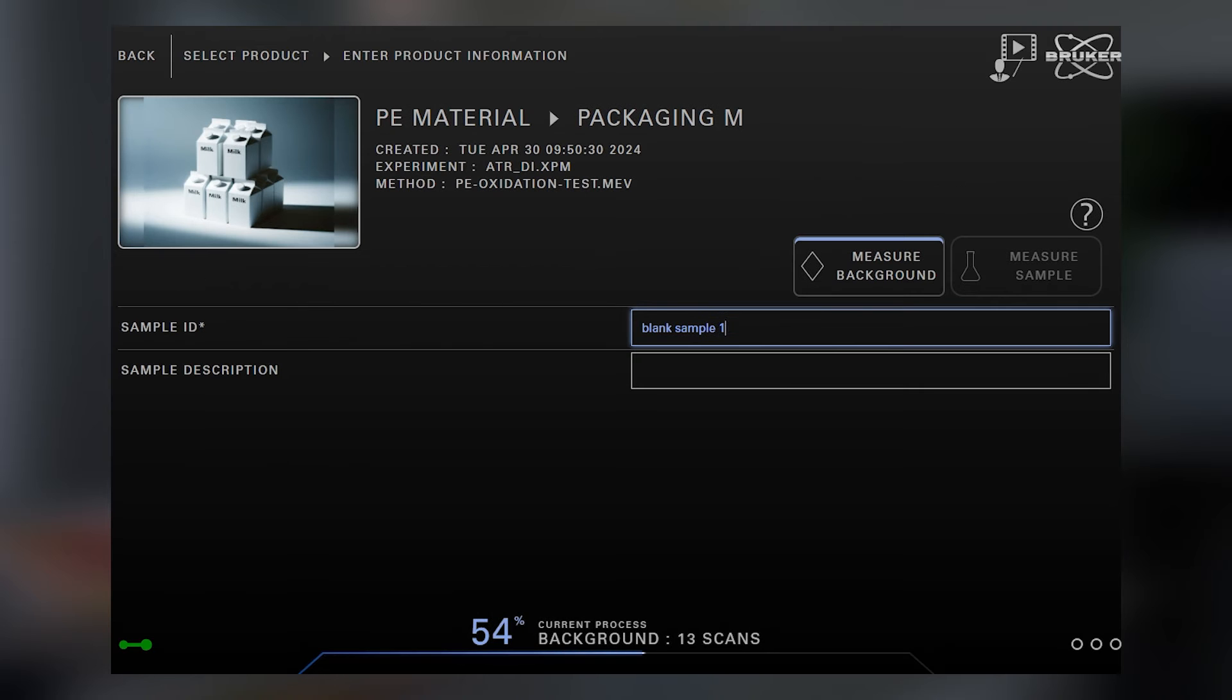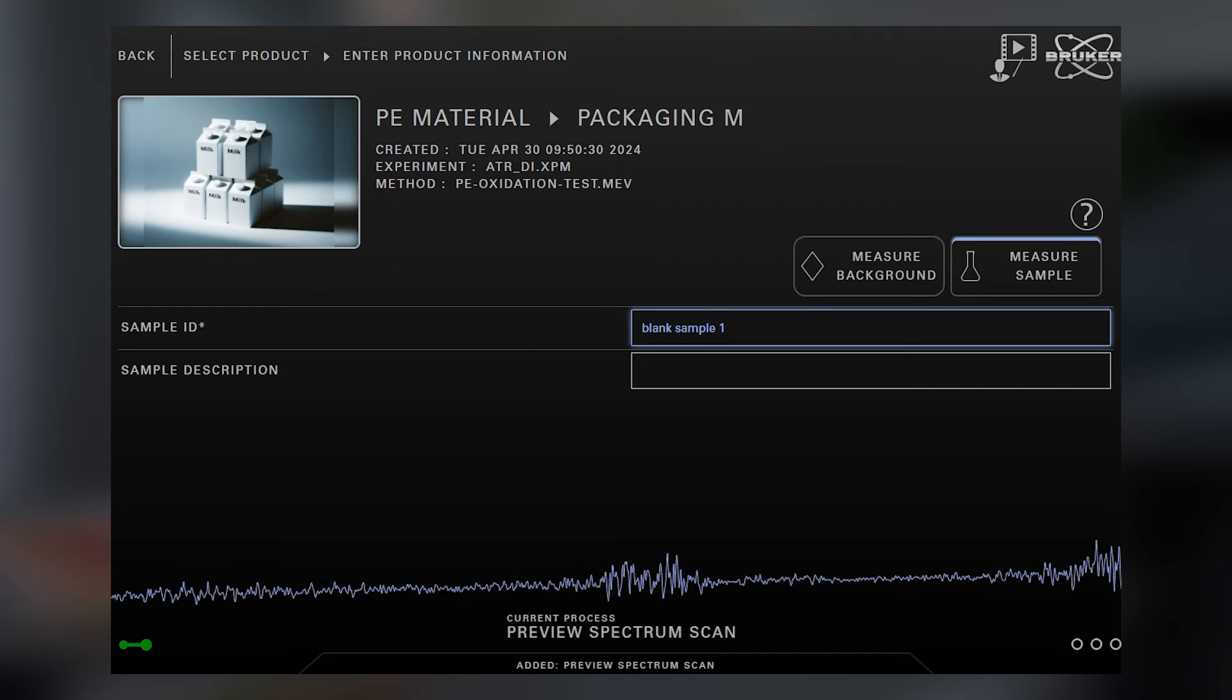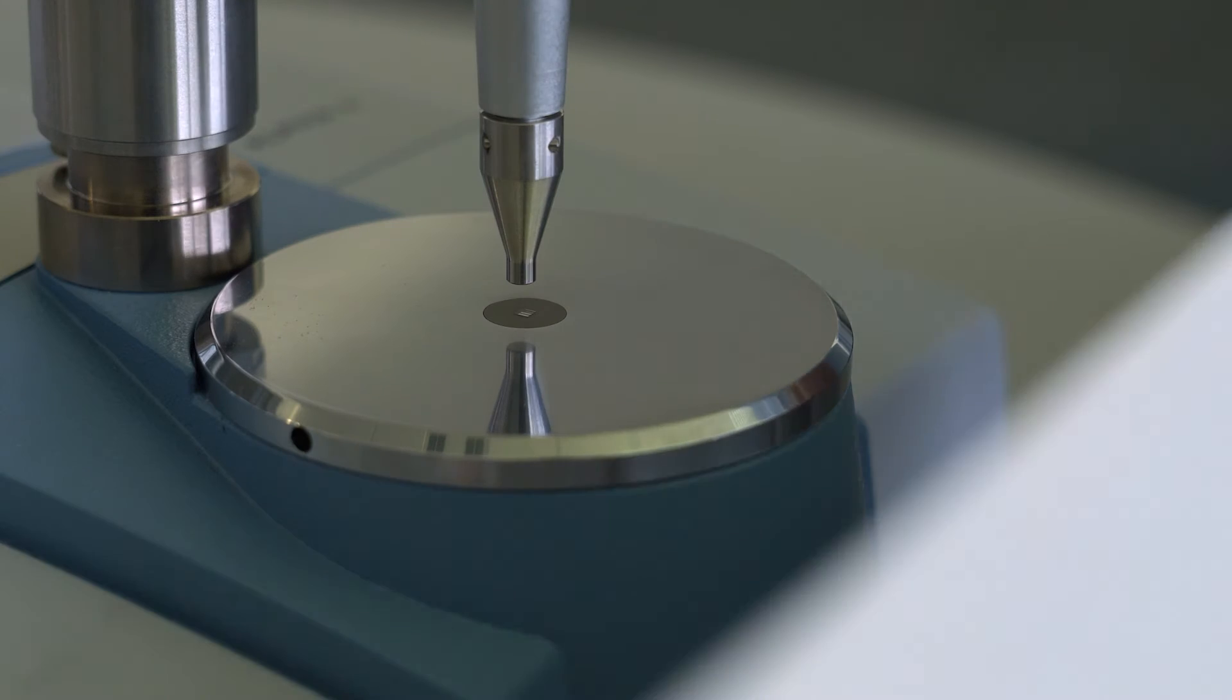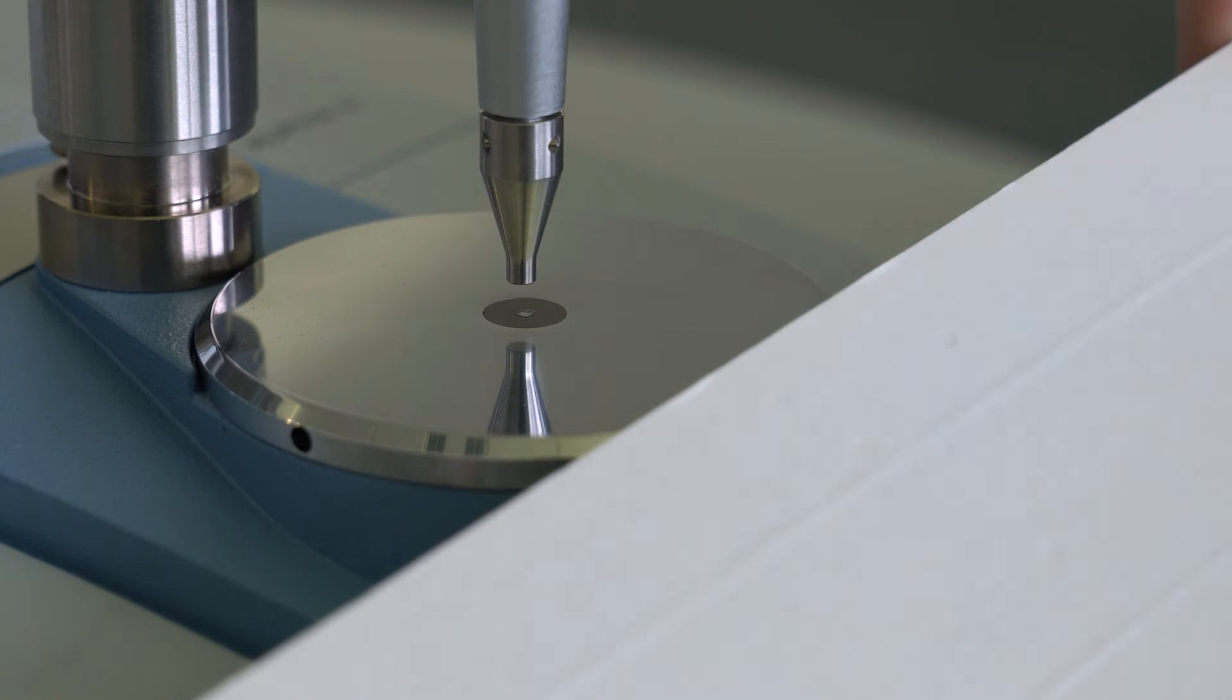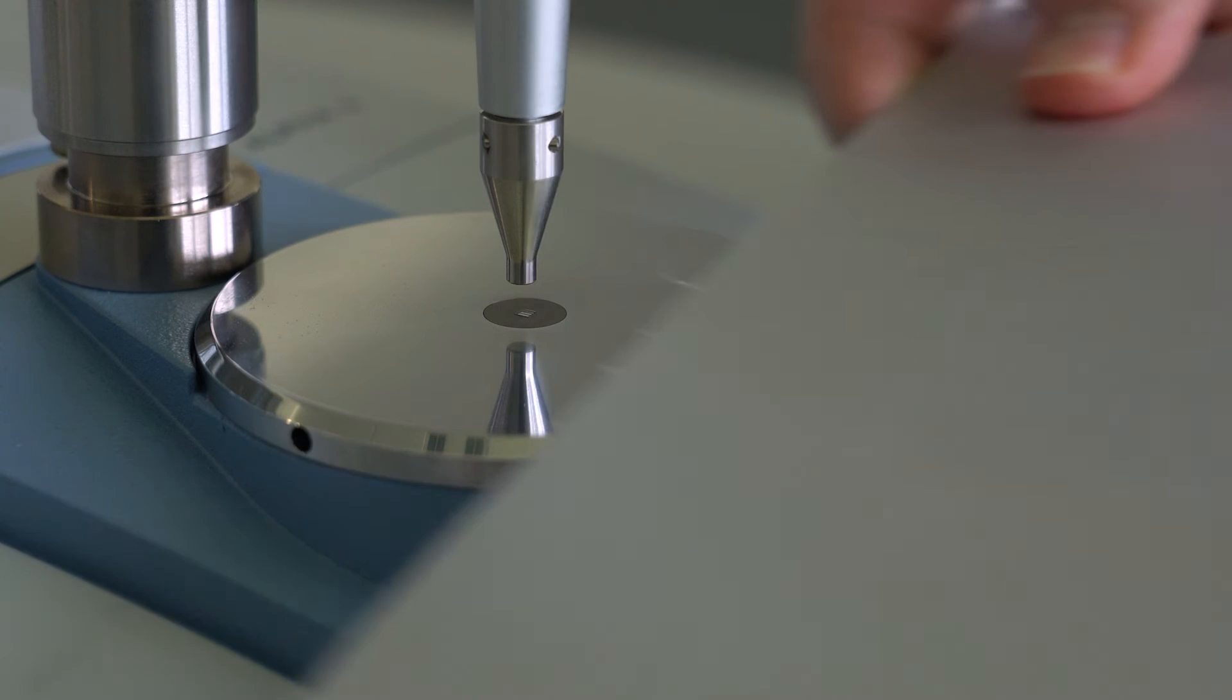Next, we measure a background and enter the sample data while we wait. After the background has finished, we place the sample with the PE layer facing downwards.